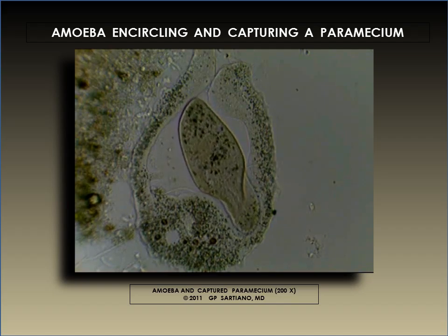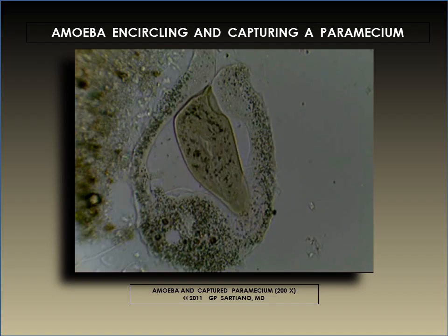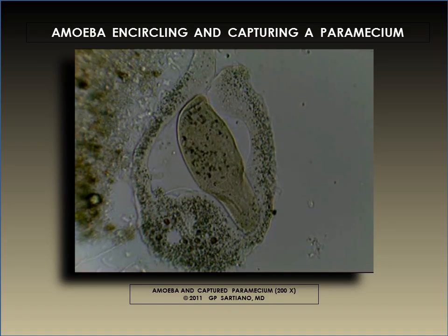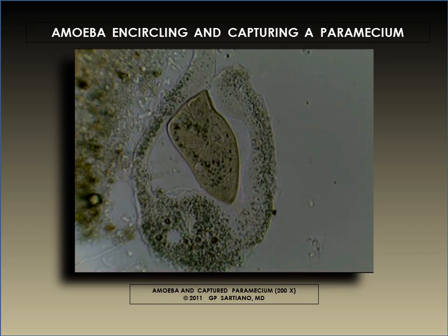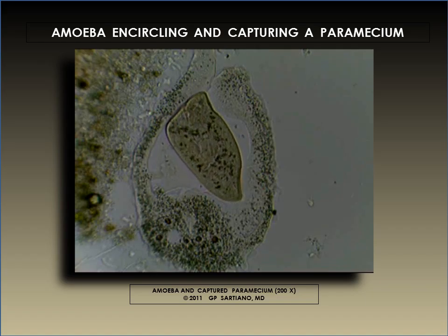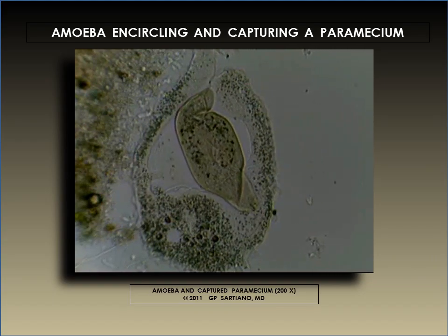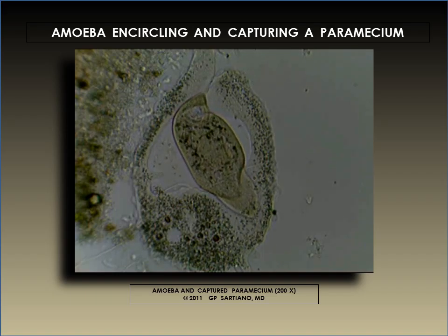Note the growing degree of distortion of the paramecium's body as it comes under progressive restriction by the amoeba. The paramecium seems to be on the losing end of this struggle. Now, in a desperate final adaptation to the progressive reduction in available space, the paramecium becomes arched and bent back on itself and seems to be in the terminal throes of the battle.